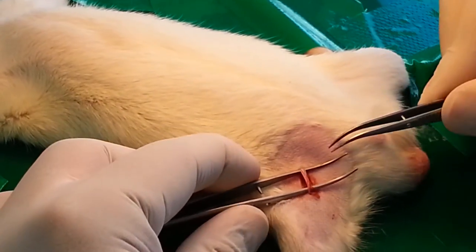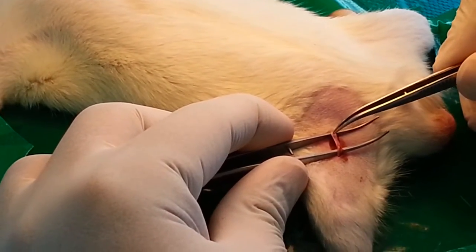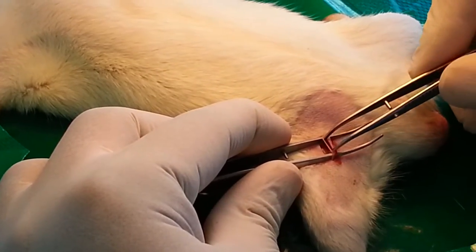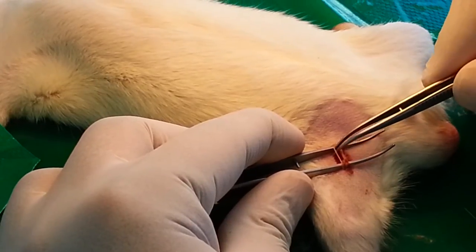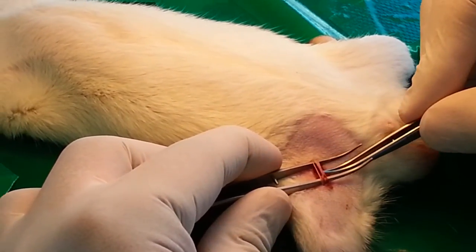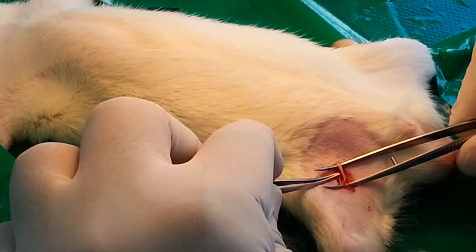There are three types of vessels. The first one on the extreme left in this position is the nerve — the nerve should not be cut, but just moved aside. Now we have two things left: one is the artery and the other is the vein.